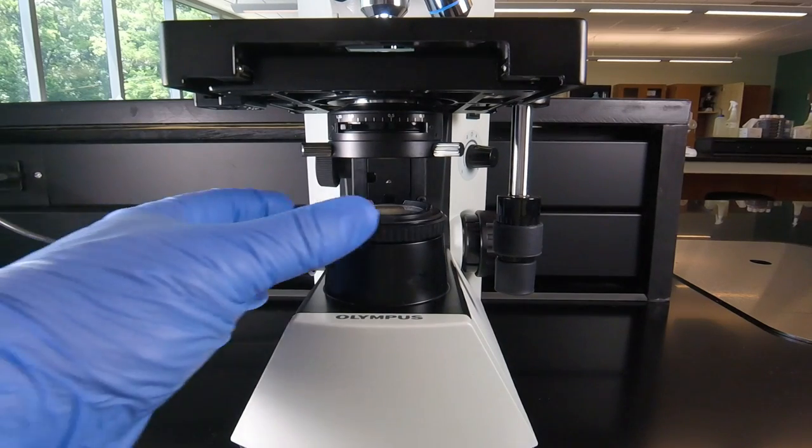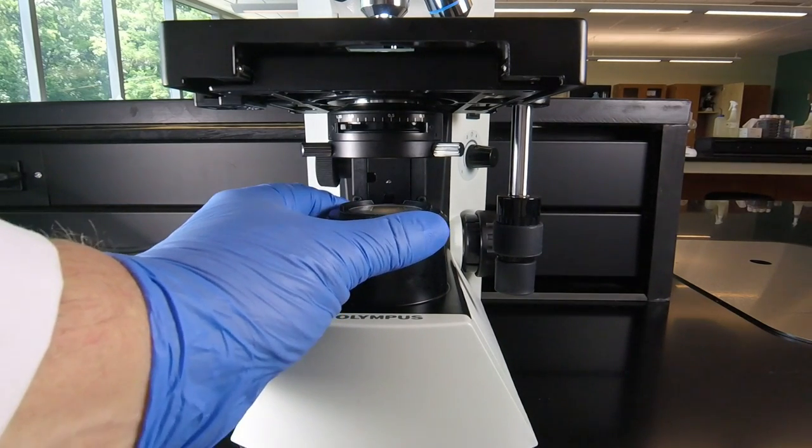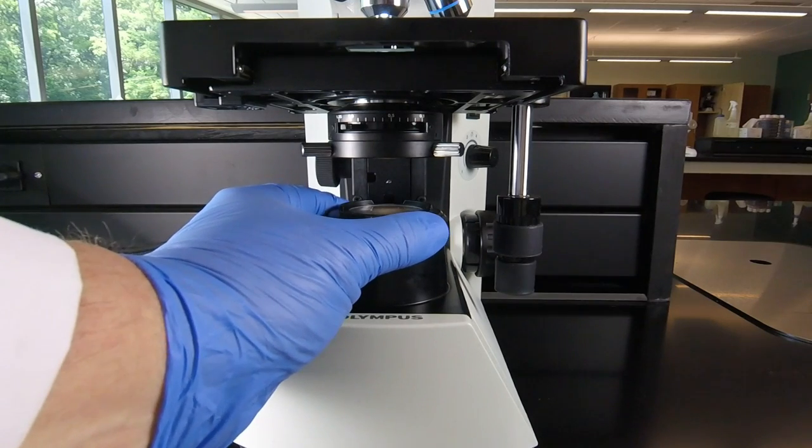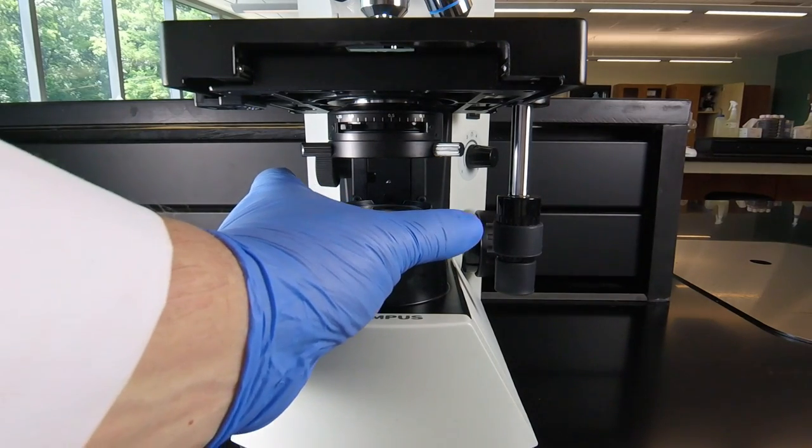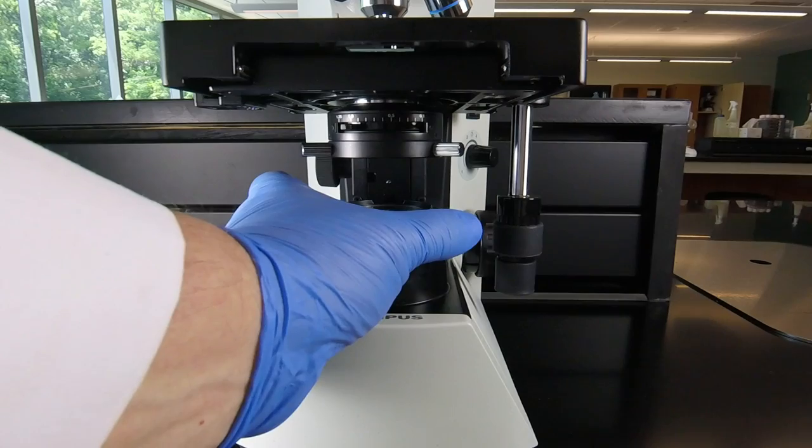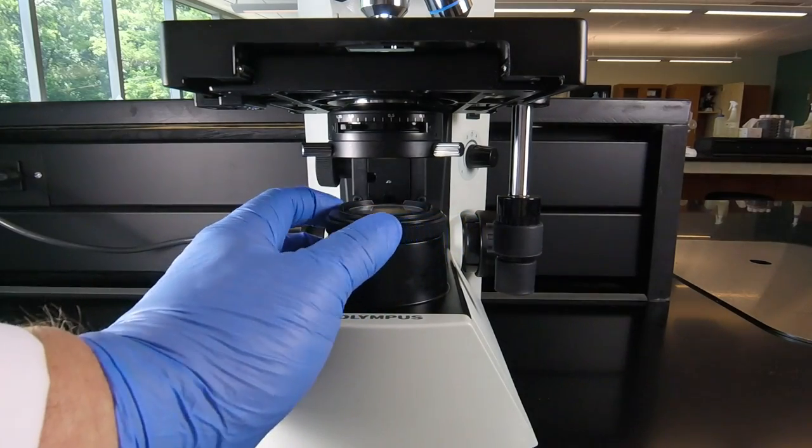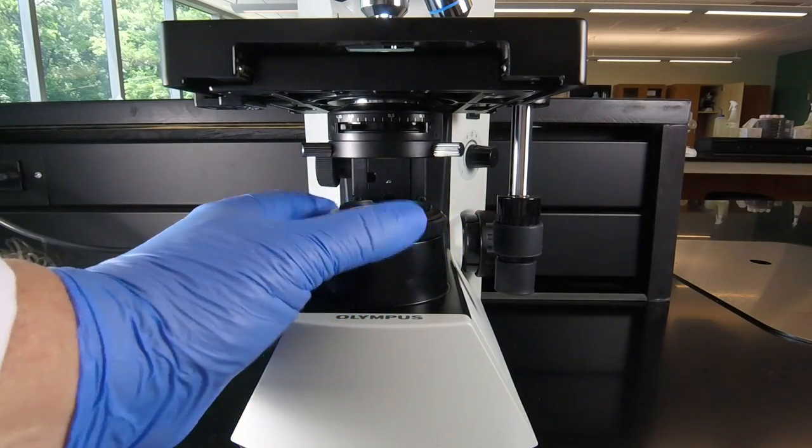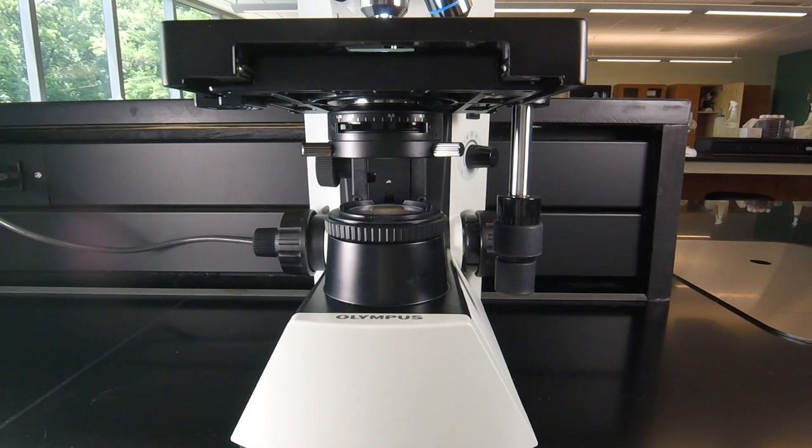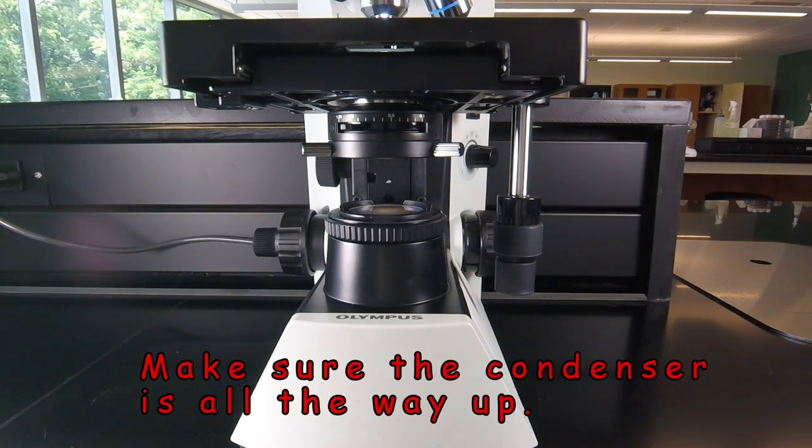There is a ring down here, and that's something that's used mostly for lower magnifications. We leave that all the way open. This can close, but if that closes, you won't have enough light for oil immersion microscopy. So that ring should be all the way clockwise or wide open when we're using oil immersion microscopy.